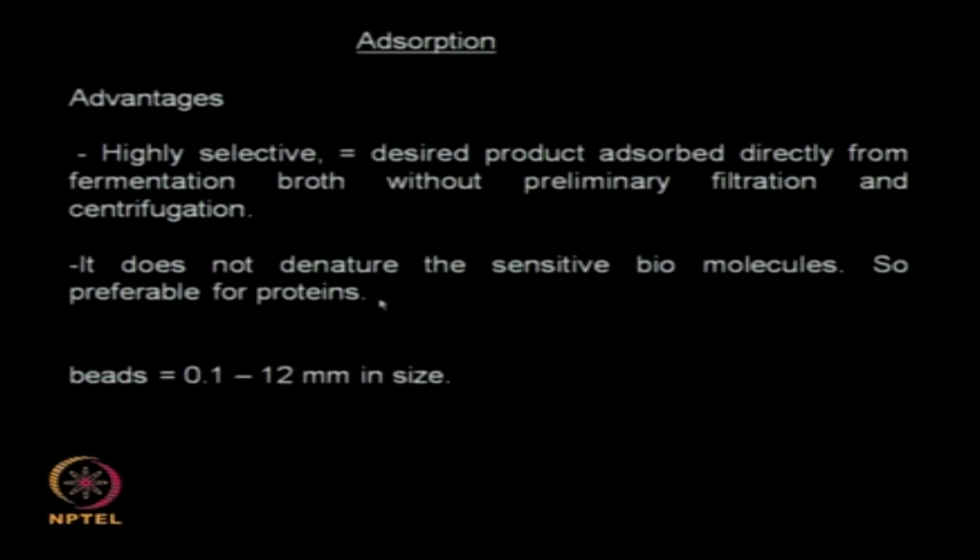So it can be preferable for proteins actually. So generally it does not denature the biomolecule. So we can have particles or solid adsorbents, it can have various sizes, it can be very small particles going right up to very large particles as well actually.